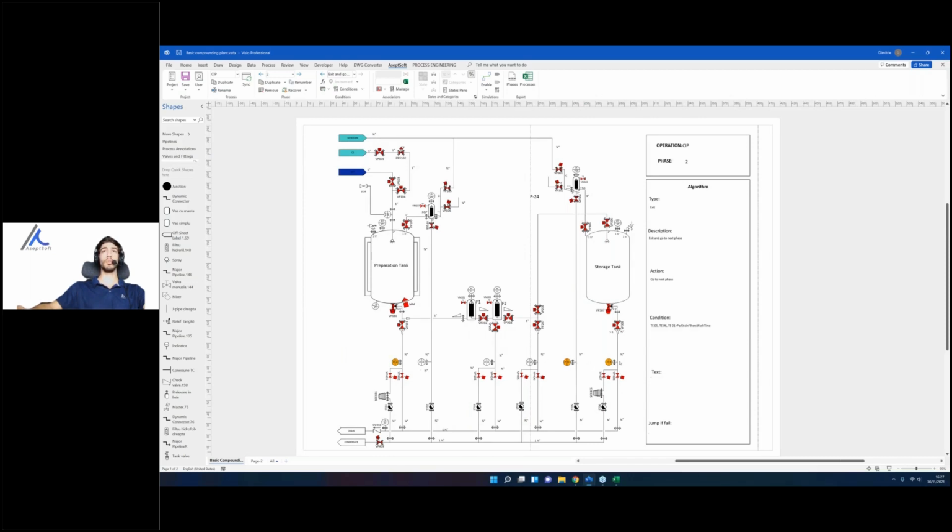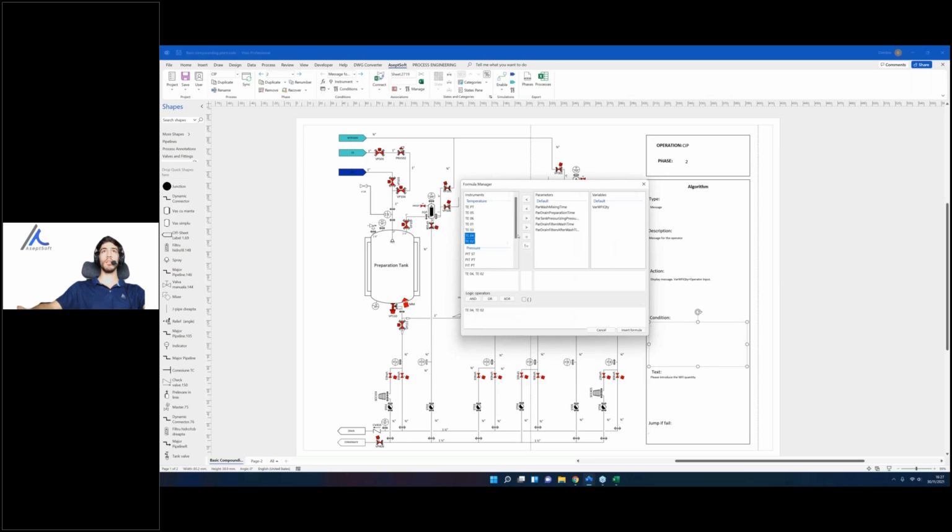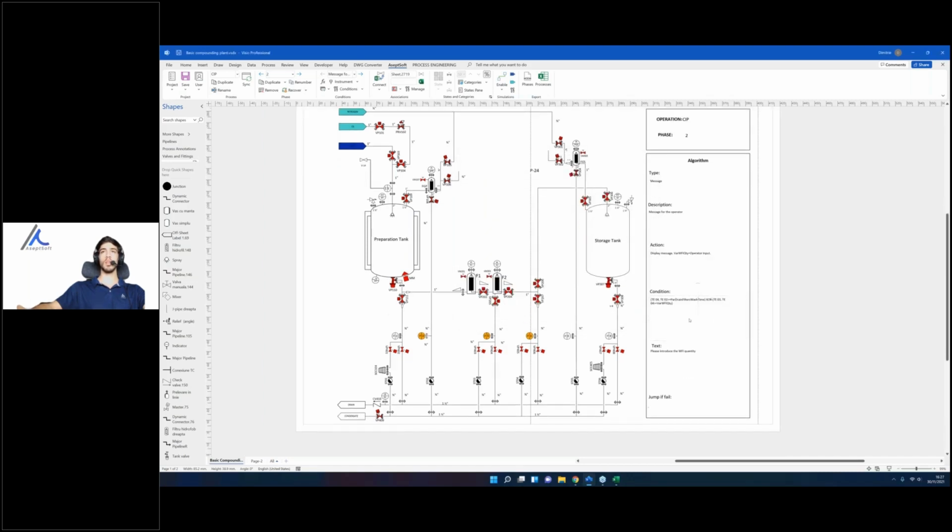And it is going to be very useful in the validation part, where you go on the field and you need to know where we are reading from and what the exact condition is. And of course, as we navigate through the conditions, you can see the highlight being toggled automatically. So it is an automated tool, and you can add virtually as complicated formulas as you want with logical operators and parameters and variables, and you can fully customize it also. And you can see it was added here.